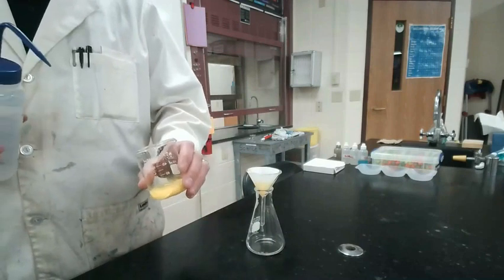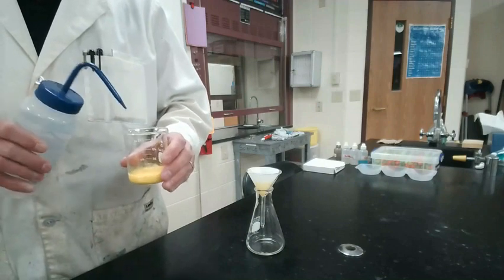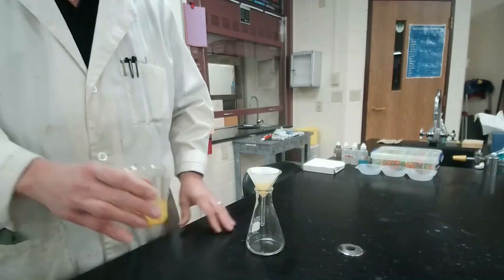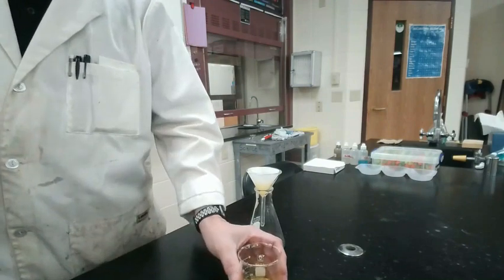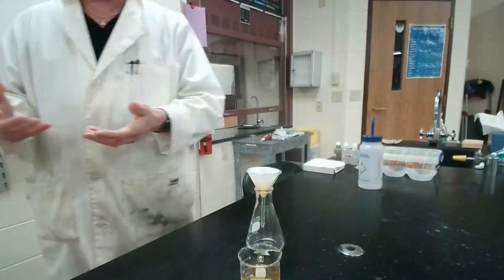Now, what I'm going to do is rinse a little bit of water in here. The reason I'm doing that, ladies and gentlemen, is yes, I'm putting water in there, but my job is to get rid of the sodium nitrate ions that are still in the water. So by adding a little water, it'll make them dissolve into the water a little bit more.